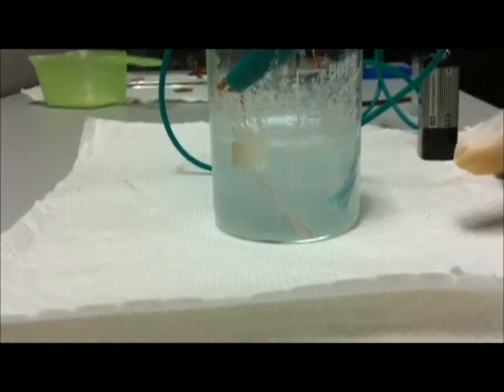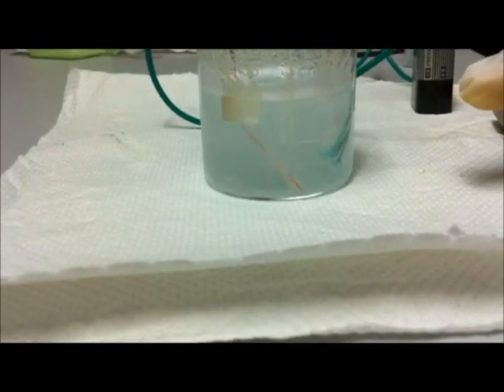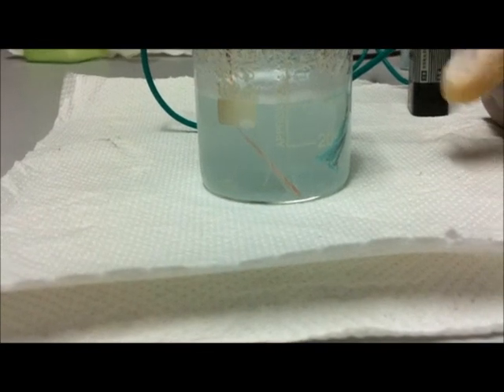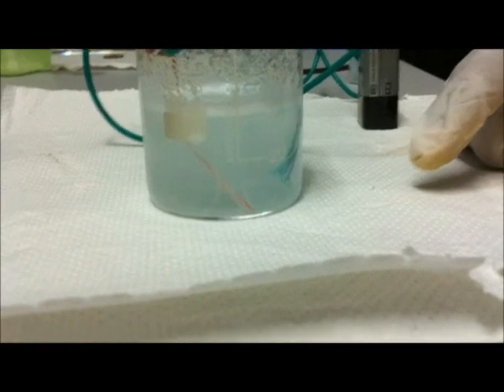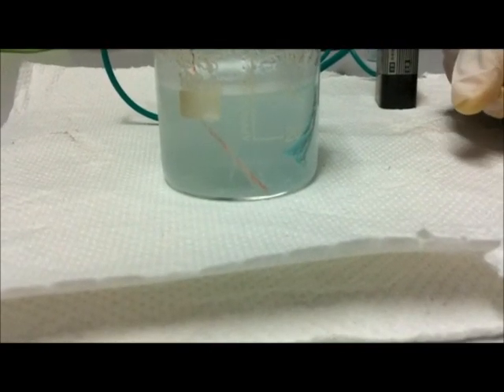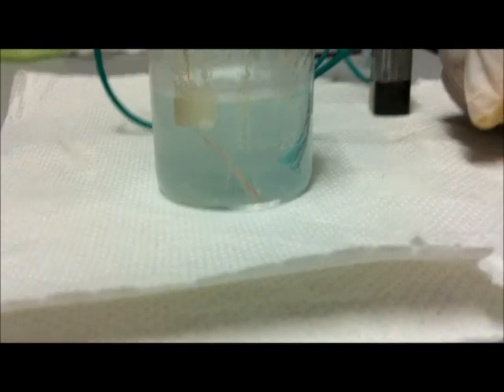So what's happening right now? First, at the negative electrode, the water is splitting into hydrogen and hydroxide. The hydrogen bubbles off as hydrogen gas. Hydrogen ions bubble off as hydrogen gas.